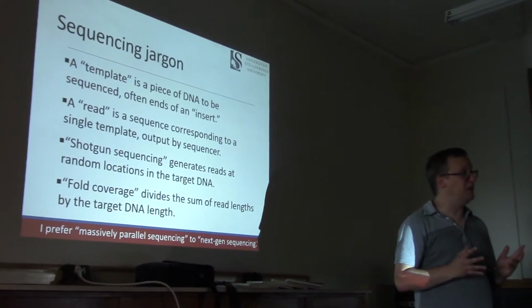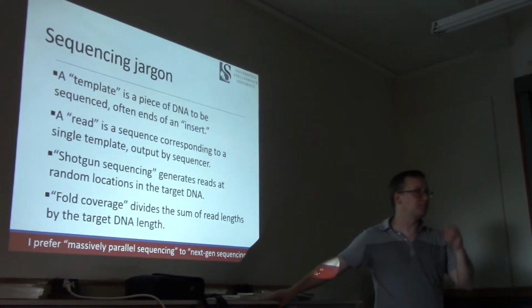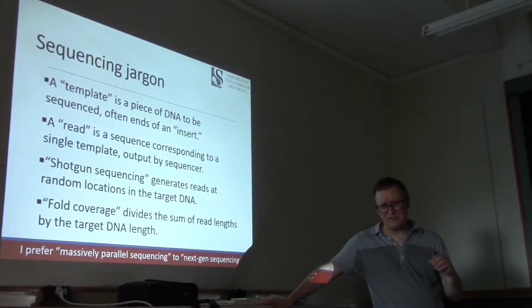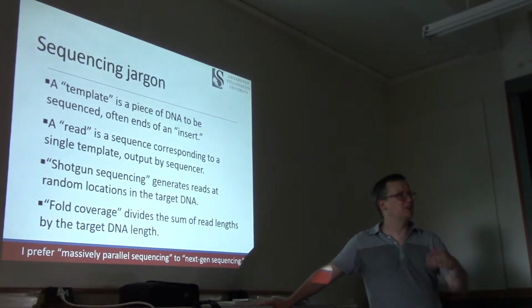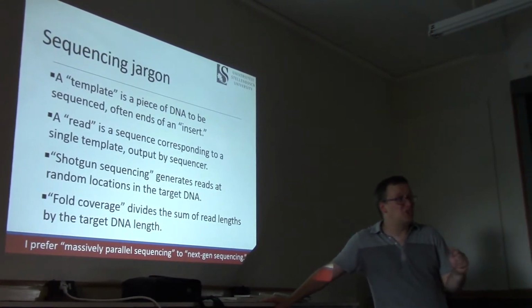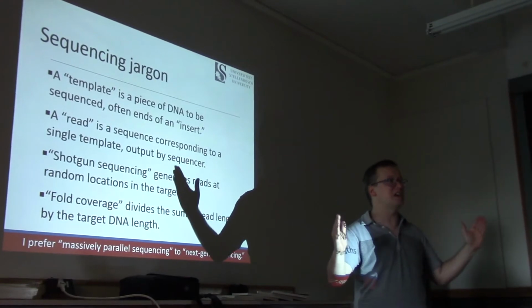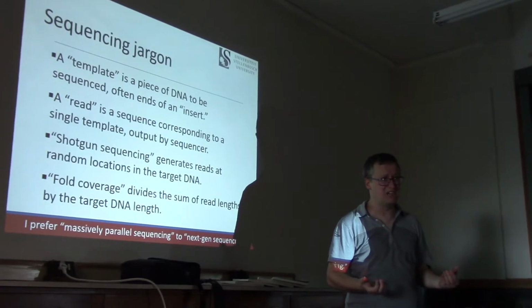One of the ways that we characterize the quality of sequence we have for a species is by fold coverage. So if you are working with a fungus that has a very loose bit of knowledge about it, it was found in this particular sample, but we don't really have anything else in a similar genus and so on, and we've sequenced it at 2x coverage, it means if its genome is X nucleotides long, we've produced only 2x nucleotides in sequencing reads.